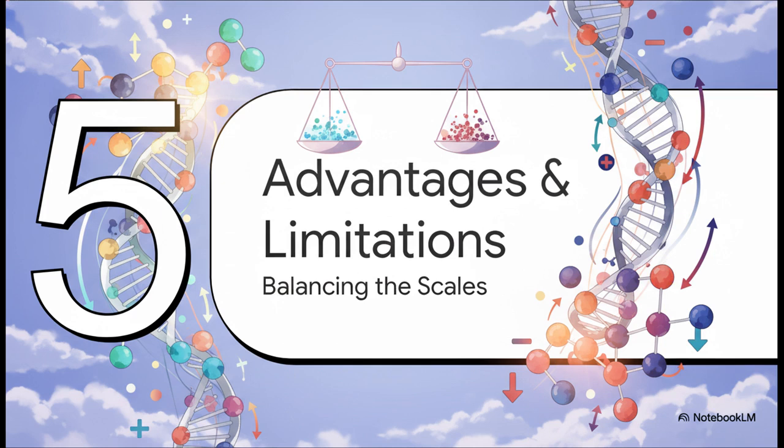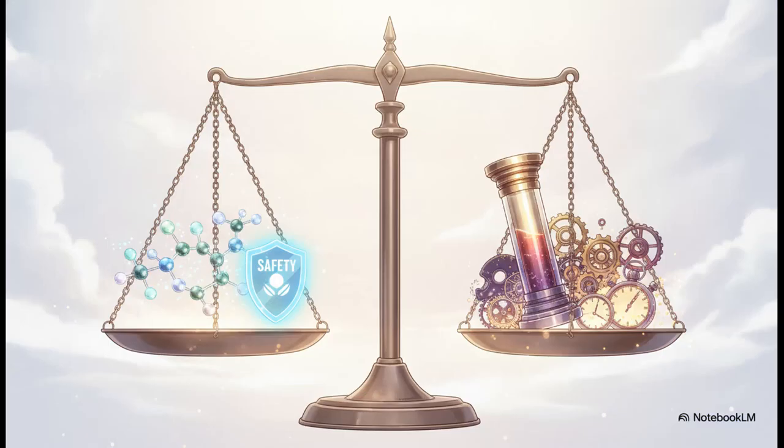Section 5. Advantages and limitations. Time to balance the analytical scales. Now, no analytical technique is perfect, so we have to balance things out here. The advantages are absolutely undeniable. This technique gives us unparalleled selectivity and is quite literally vital for ensuring drug safety and efficacy. It delivers the ultra-high sensitivity and reproducibility needed to meet those strict regulatory standards.